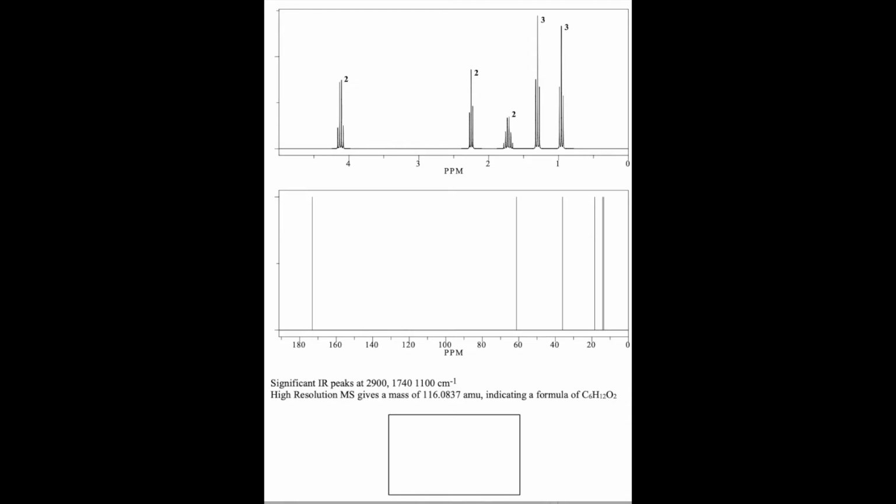It's very common when you have an NMR spectrum to truncate the spectrum and only show the parts that actually have data. So while a normal proton NMR would range from 0 to 10 or 12 ppm, this one only goes up to 5 because there's nothing above 5. So don't look at it in terms of real estate. Don't think, oh, the leftmost peak is in the pi region. You've got to look at the actual chemical shifts, right? The actual frequencies. So yeah, that one peak at about 4.1, that's in the electronegative region.